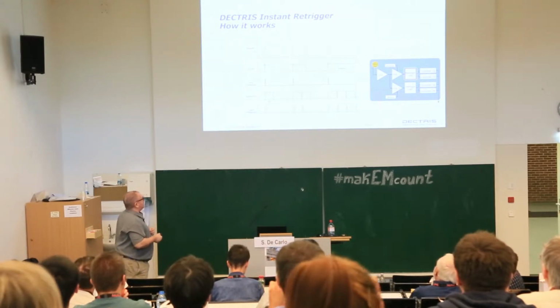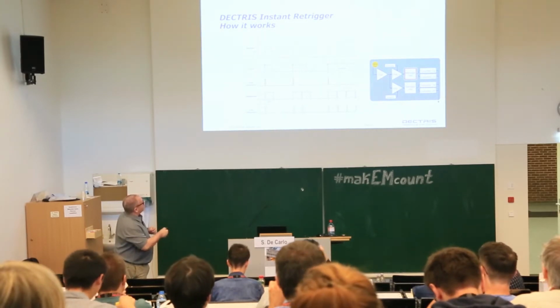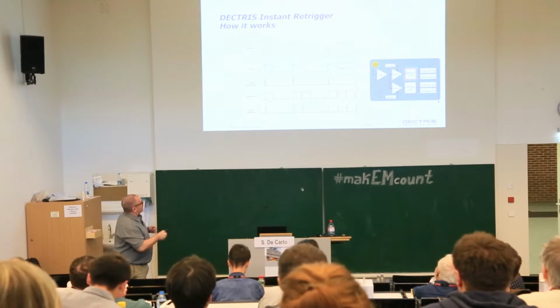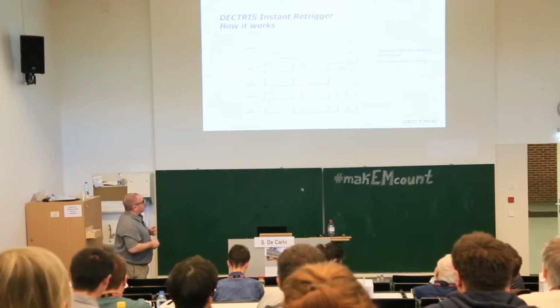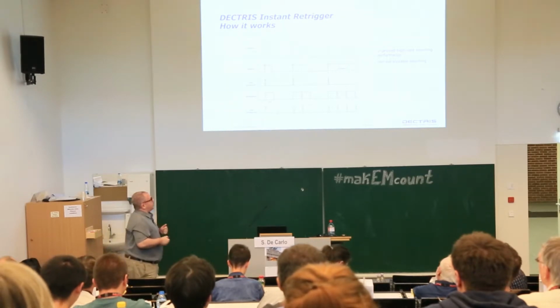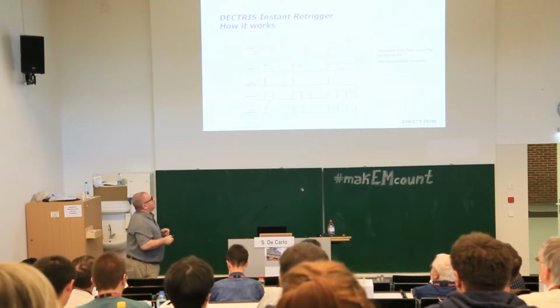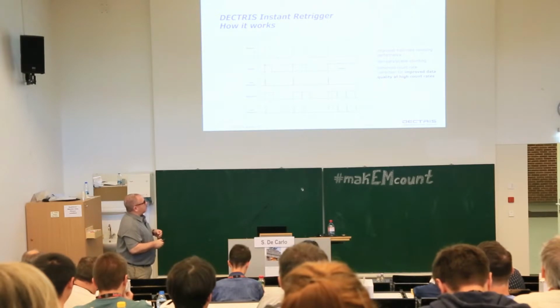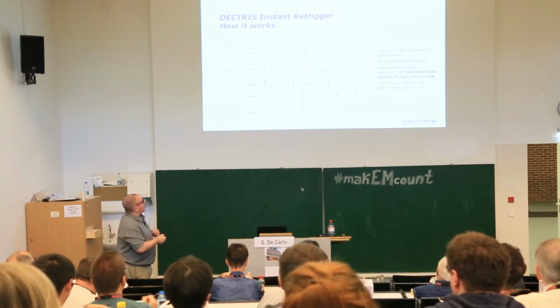Of course, it's not going to be perfectly linear. I will show you later why. But in the normal situation, you have one count. Here you have 2 events close to each other, so you correct to 2 counts. And in the case of a pileup, here you have 1, 2, 3, 4 events, and these are correctly counted. Of course, there is going to be a limit. But in principle, by reintroducing the retrigger units in Eiger 2, we have a much improved count rate. So we're talking about mega counts per pixel per second. The counter is not paralyzed. This gives you a better count rate, gives you improved quality for the data. And I will show you what the curves look like for electrons.